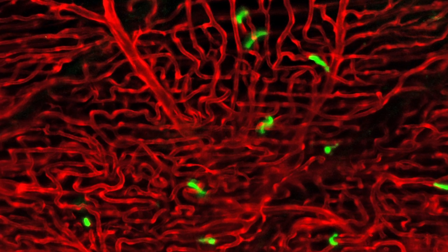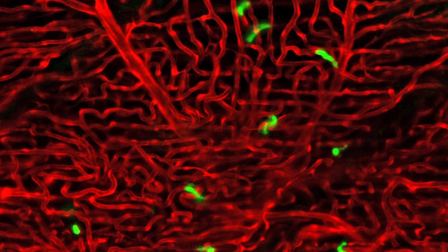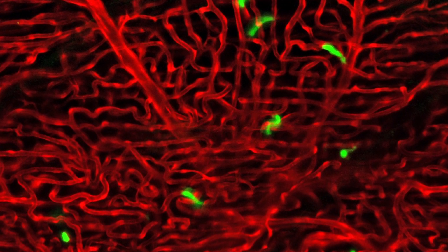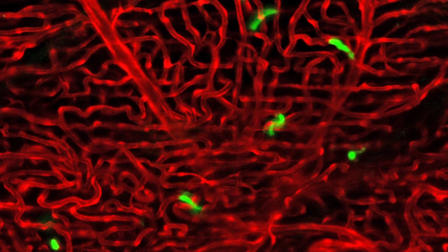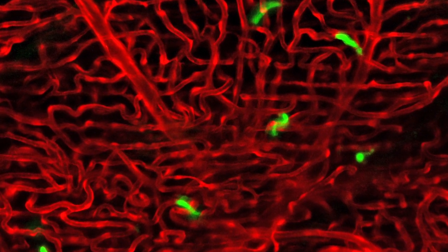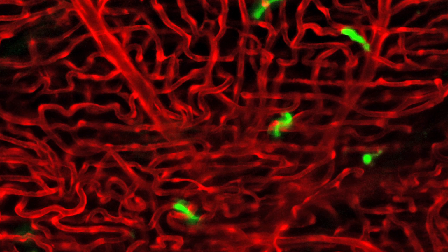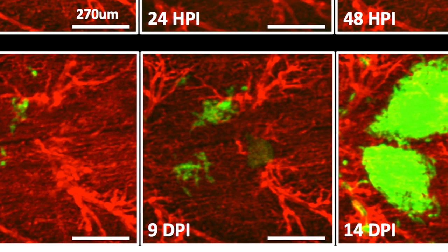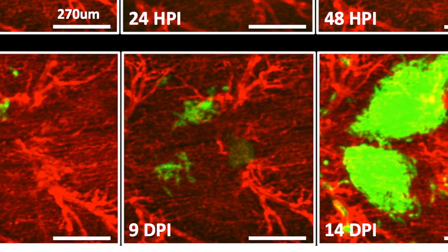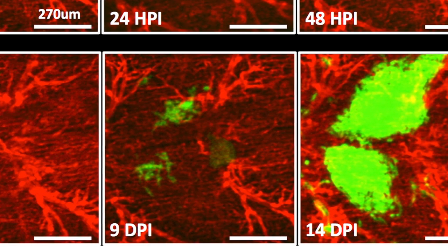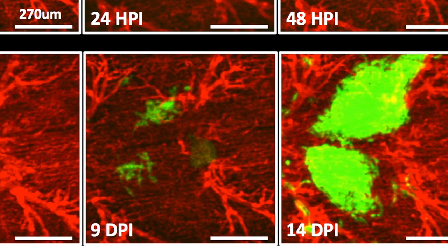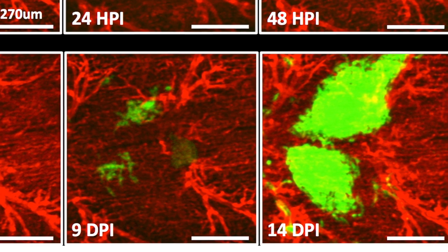This image is of green tumor cells trapped in red blood vessels, and this is actually in the tail of a transparent zebrafish. And so, these tumor cells, over the course of time, will actually leave the blood vessels and begin to form metastasis.